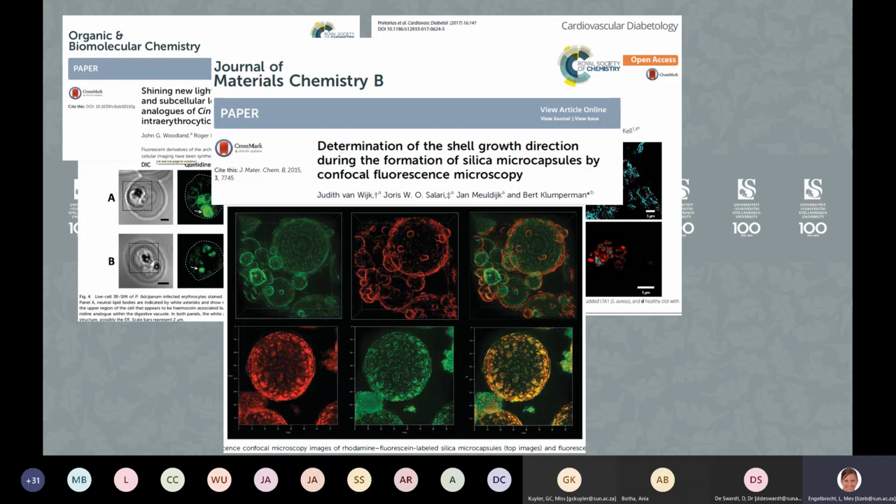We can also use super resolution on polymer samples. These are little microcapsules where they form with different monomers, and the first monomers, in the top example, were green monomers. Eventually they added non-stained monomers, and lastly they added red-stained monomers. And if you see on that image there, there's actually a gap between the red and the green. You will not see that gap with normal confocal.